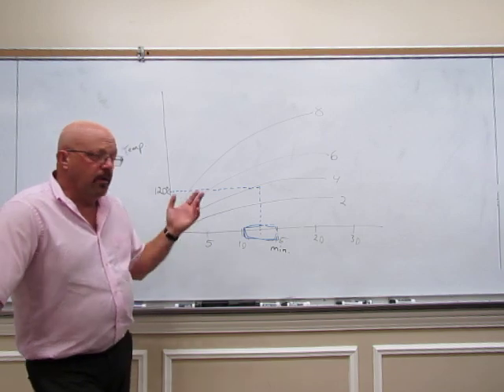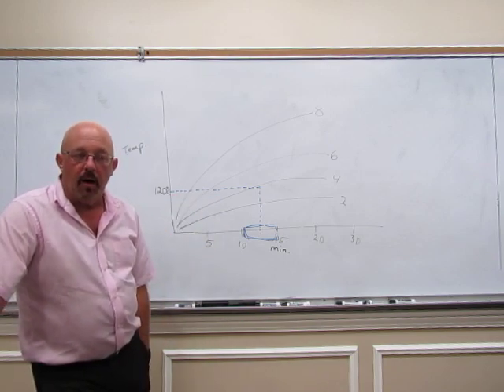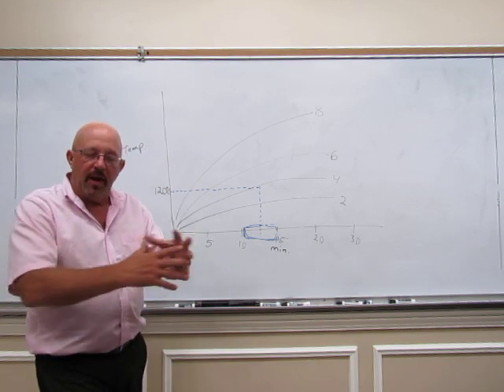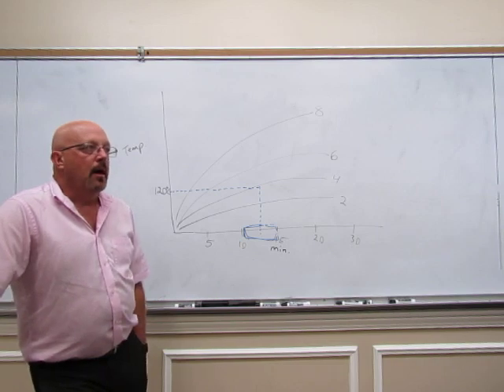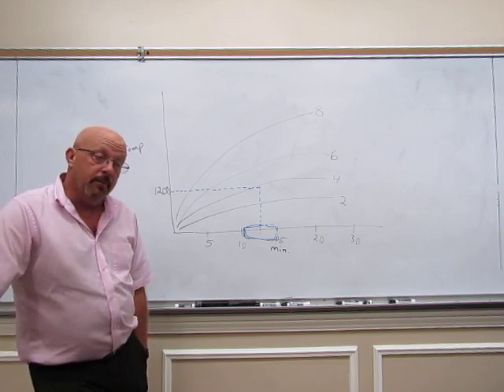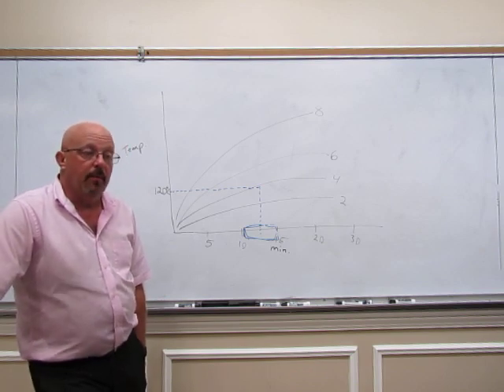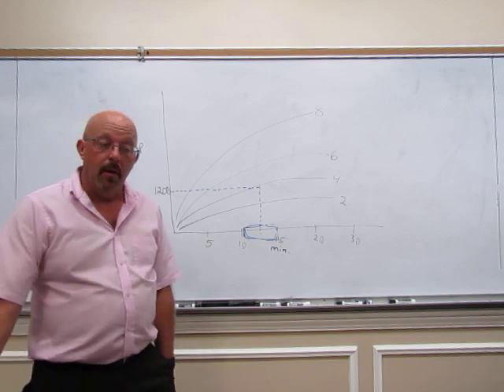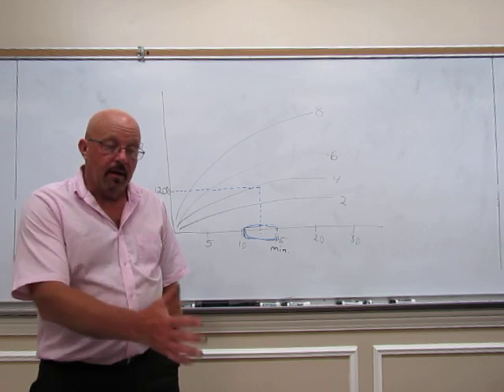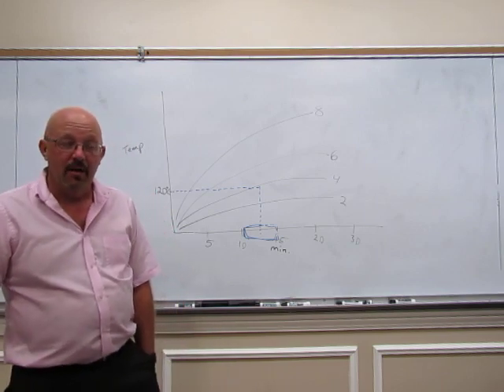So melting points can be used to tell us something about the purity of our compound. So again, impurities will lower the range and broaden the range. It can also be used to help confirm the identity of a compound. So let's say we have some unknown. We can go take the melting point of this unknown and then compare it to a known compound, so you can use it to help identify.